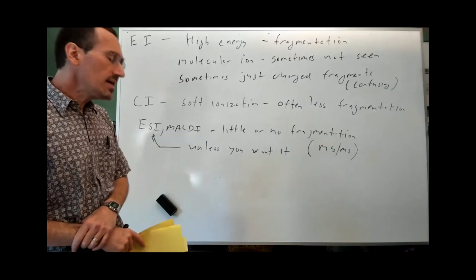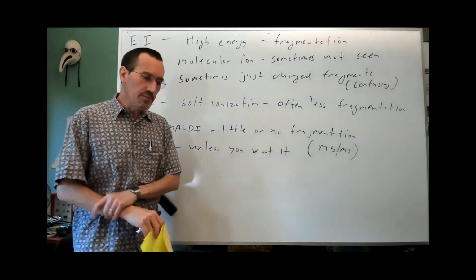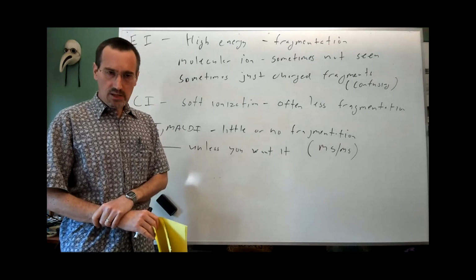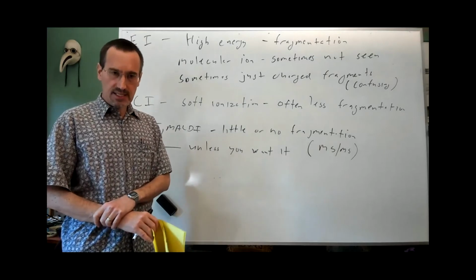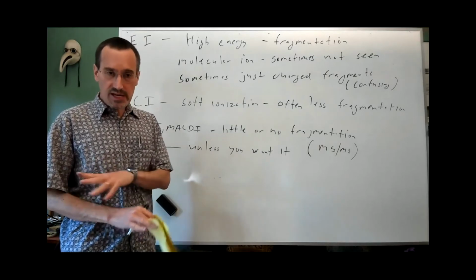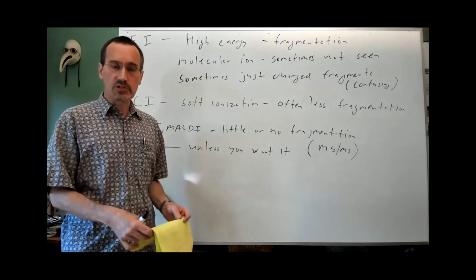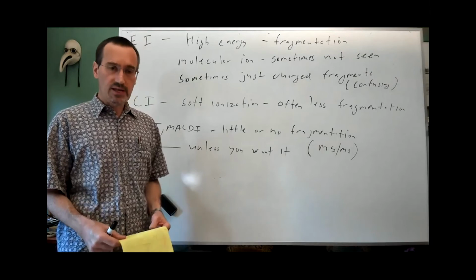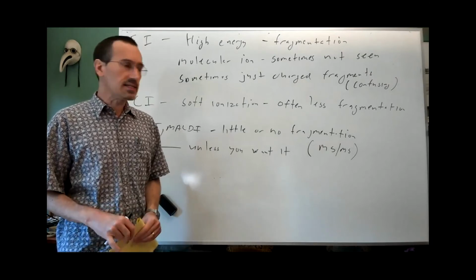Dr. Nowick? Yeah. So you're saying that you use ESI mainly unless you actually want fragmentation? In general, and certainly the mass spec facility now is set up very well for access to ESI and for MALDI. It's open access, and these are good modern instruments that you will get to use yourself in your research, and that's nice.